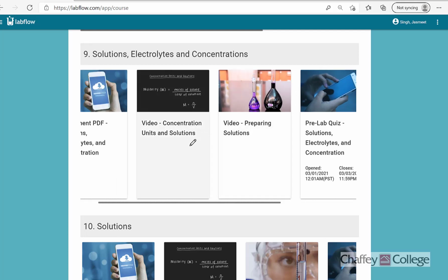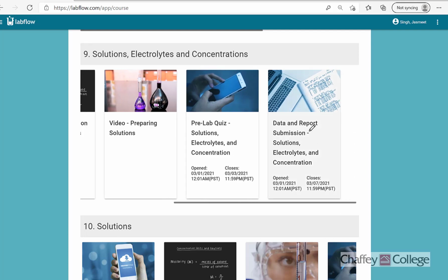These videos will show you how to calculate the concentration of any solution, and they will also describe the units, and show the method to prepare a solution and how to prepare a dilute solution from a concentrated solution. So let's take a look at the lab report.